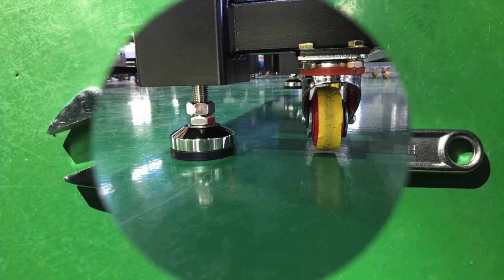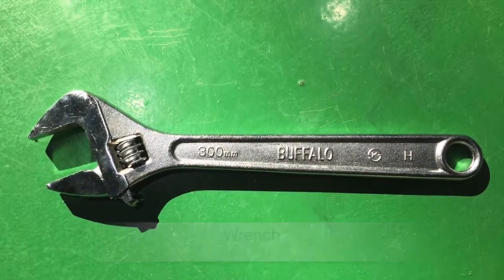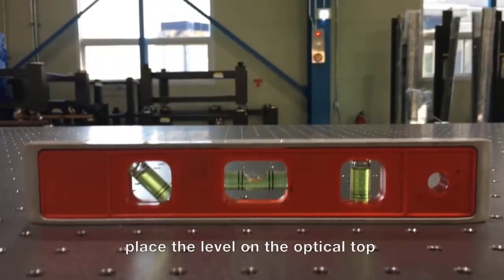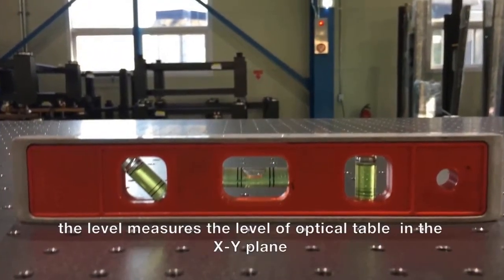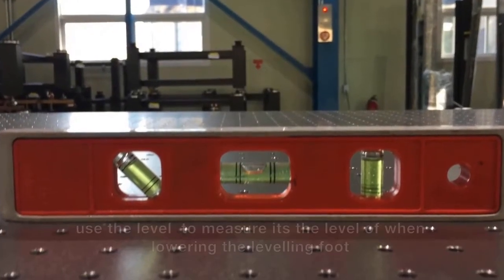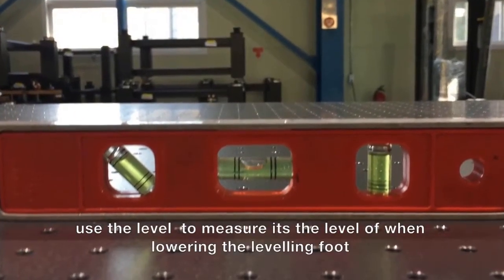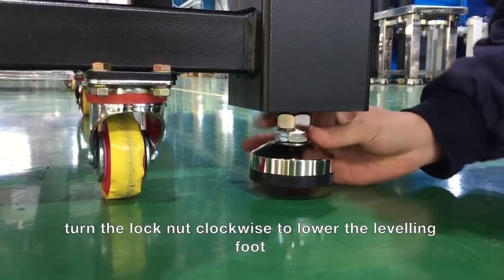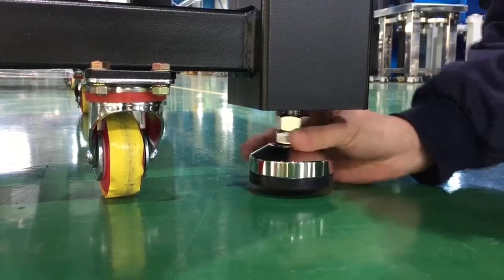Step 2. Lower the leveling feet to secure the table to the ground and ensure the casters are in air. You will need a wrench. To align the table straight to the ground, use a level — you can simply place it on the table and check its position in the xy plane. To lower the feet, simply screw them clockwise with your hand until they touch the ground.